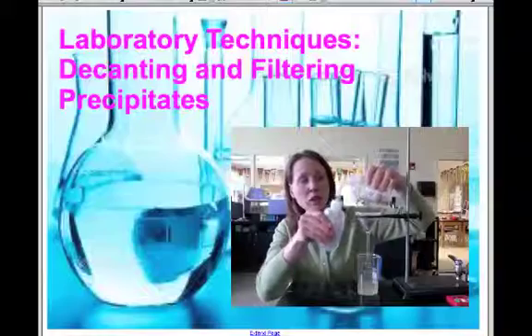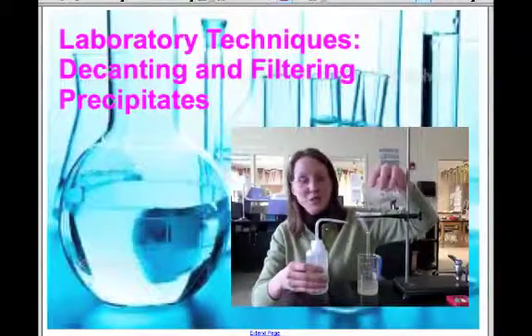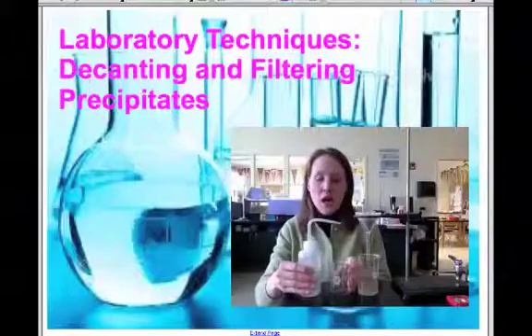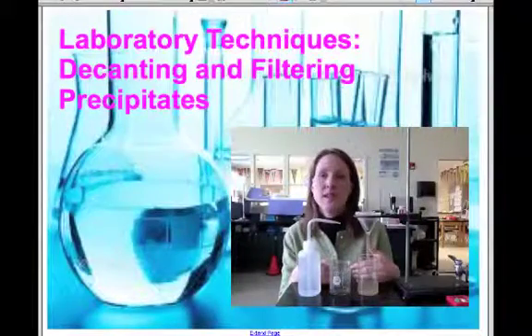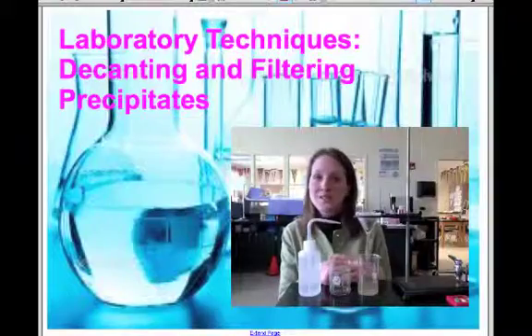So you want to make sure that you do get all of your product out. So that's obviously important for your percent yield. I haven't been completely thorough, but hopefully that makes sense, and hopefully you'll be able to perform both of these procedures when you separate your precipitate out of your mixture. So thank you very much.